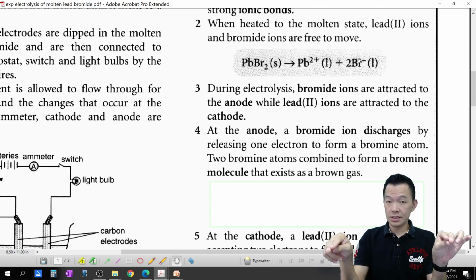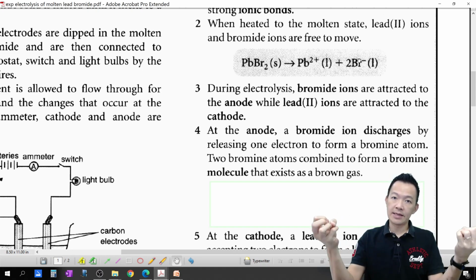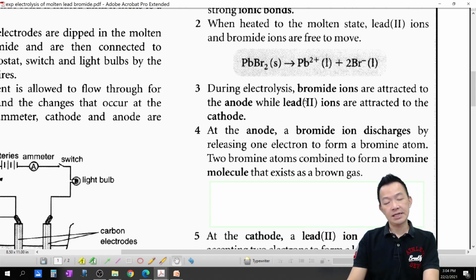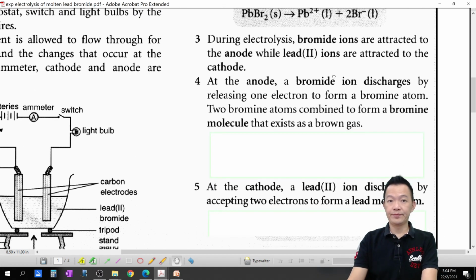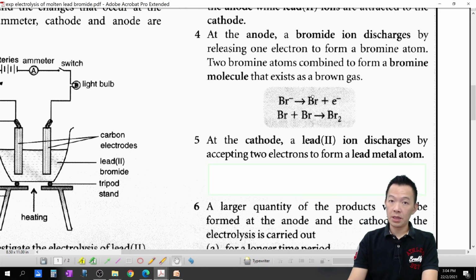And when you on the switch, anode cathode going to attract the anion and cation，对不对？它们都各自拉到它们的离子。And the ion going to discharge，那些离子呢就会 discharge。bromide discharge 变成 bromine，lead ion 变成了 lead 啦。So bromide lost electron become bromine. But bromine atoms join together become the bromine molecule.